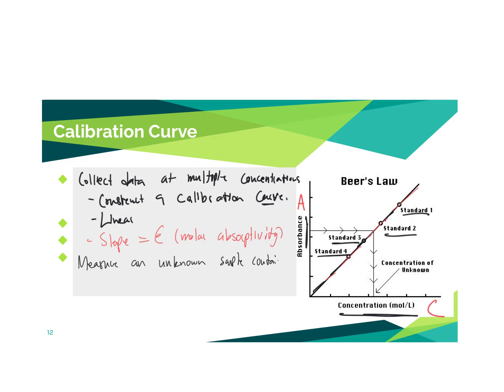containing your compound of interest, you will get the absorbance, and then from that you can find where it falls on your calibration curve, or using the molar absorptivity that you found from your calibration curve, you can calculate concentration.